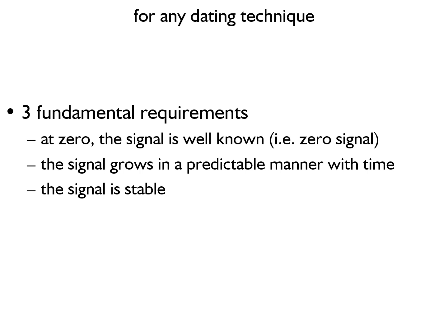But here in this presentation, I want to show you that luminescence dating fulfills the requirement to be a reliable dating tool. Essentially, that we know the initial condition, we know how the signal evolves with time, and finally, we know that the signal is stable.